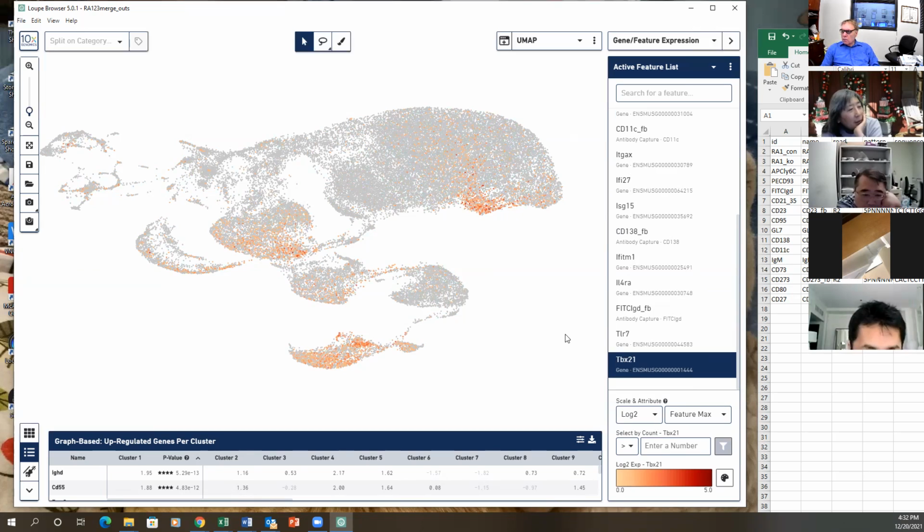So yeah, this is really good data. So okay, you can see here, germinal center, they also have high T-bet. You see, that's consistent with us. But this is another population here. Yeah, this is in my cases. You see, I show that 40% of germinal center cells are DN2 cells. 40%. Let's see, CD8.